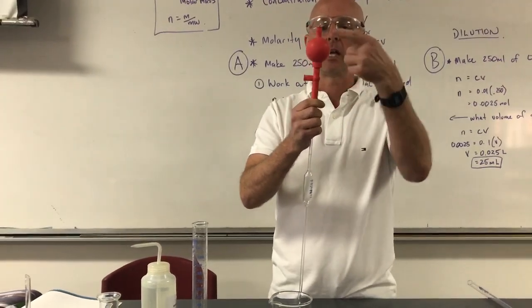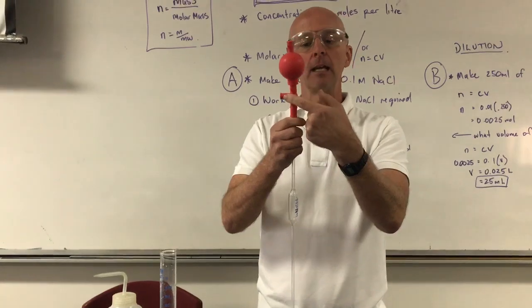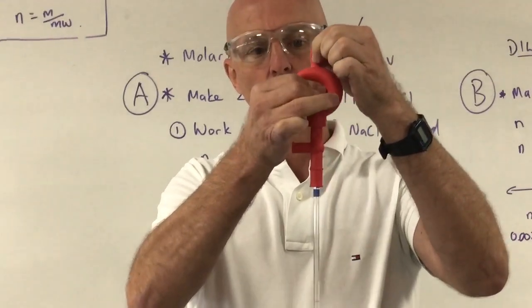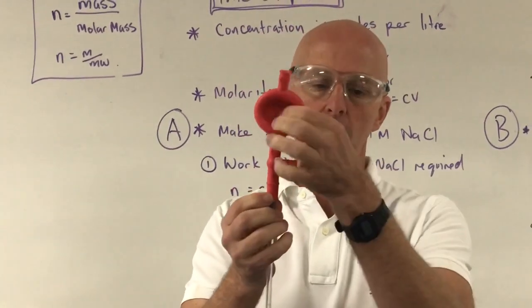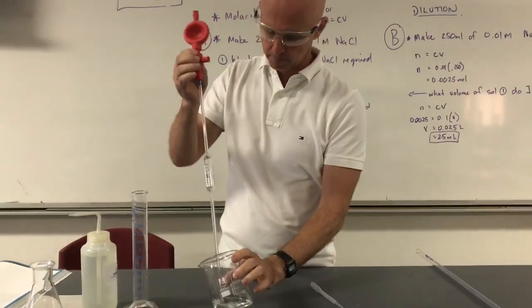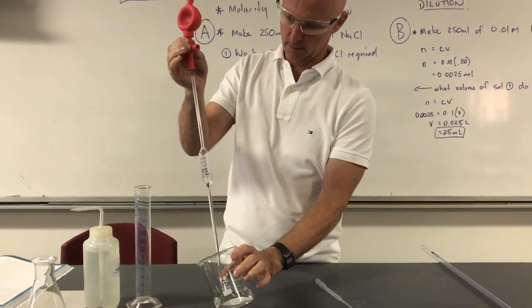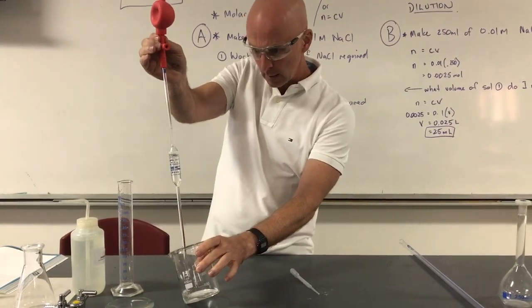What you can't see on the video is on this there's the letter A, the letter S, and the letter E. Okay, so A is to expel the air. You push that in, and then you squeeze it, and that'll make a little vacuum inside that, and then you can press S, which, yes, you guessed it, stands for suck. It doesn't refer to your online learning, but it refers to its ability to suck up this liquid.